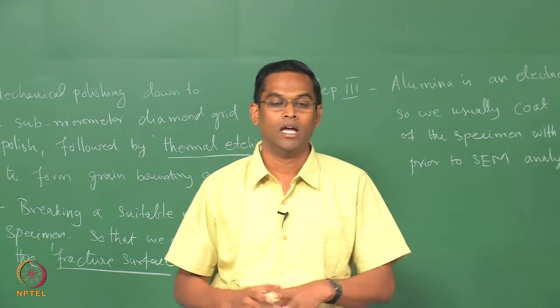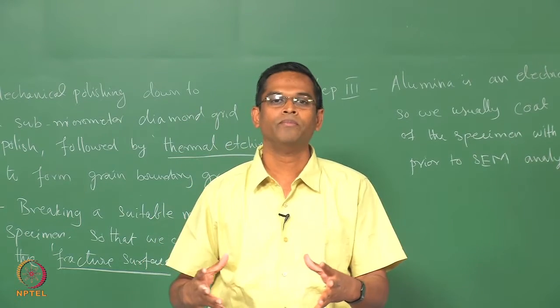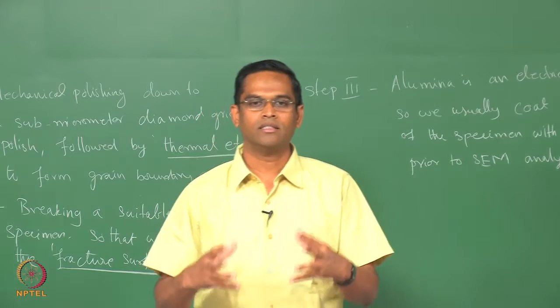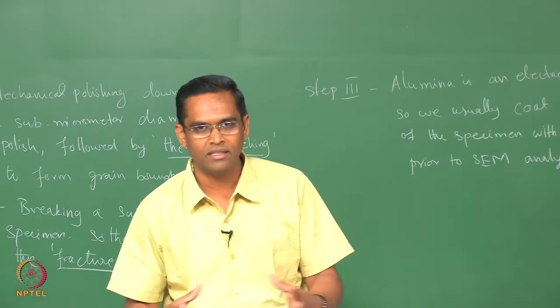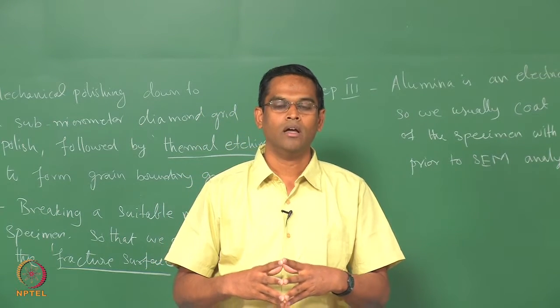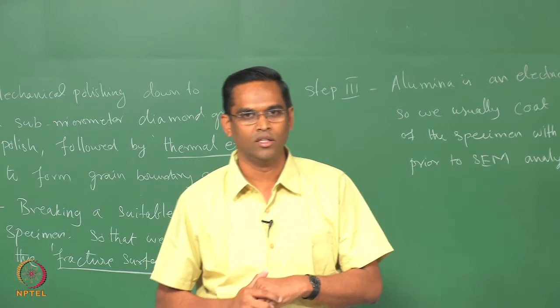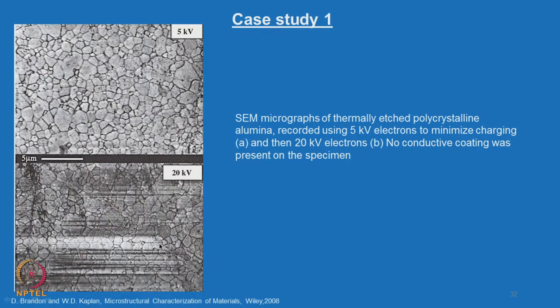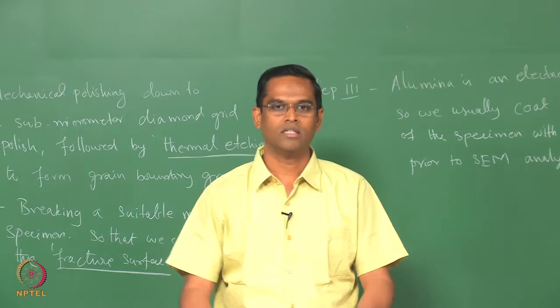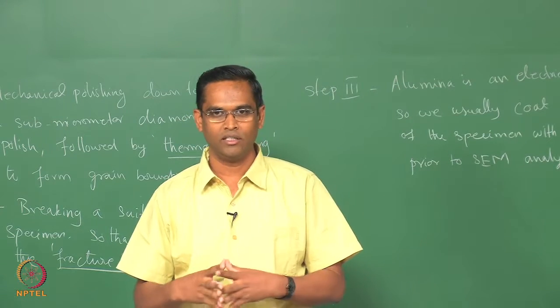But then here, why I am bringing up this detector system is that when you have the in-lens detector which can collect the secondary electrons effectively, the reason for what you are seeing as charging in this particular image, as we also discussed in the theory class, is that most of the secondary electrons emanating from the surface are hindered, or they are not collected properly, or they are interacting more like SE2 and SE3 and so on.